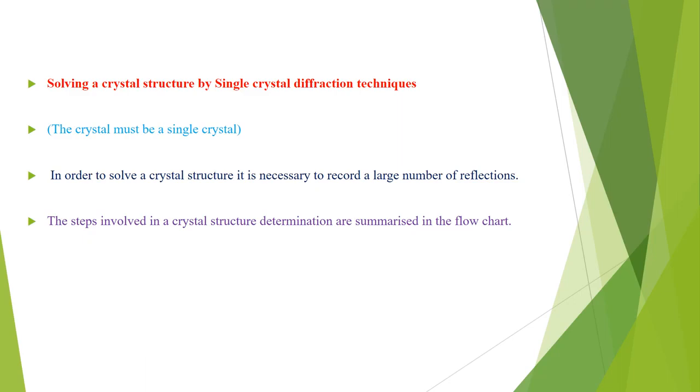In order to solve a crystal structure, it is necessary to record a large number of reflections. This implies accurately measuring their intensities and recording their direction with respect to crystal orientation and initial X-ray beam direction.